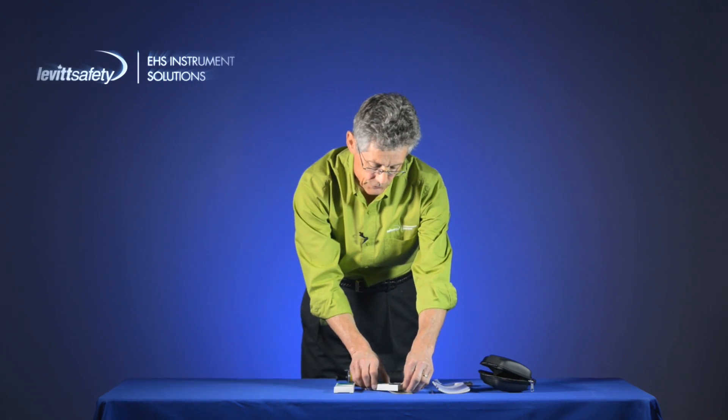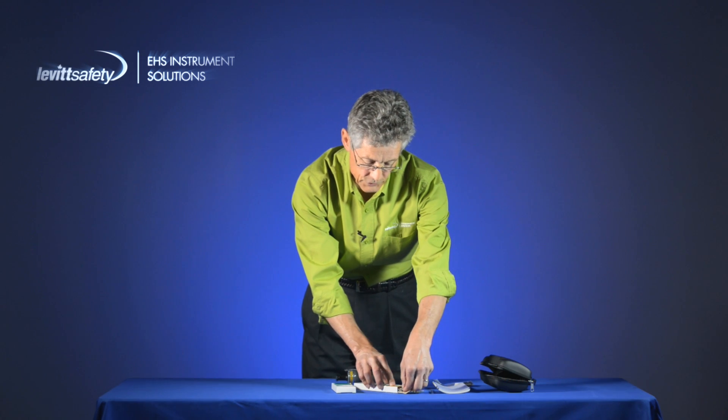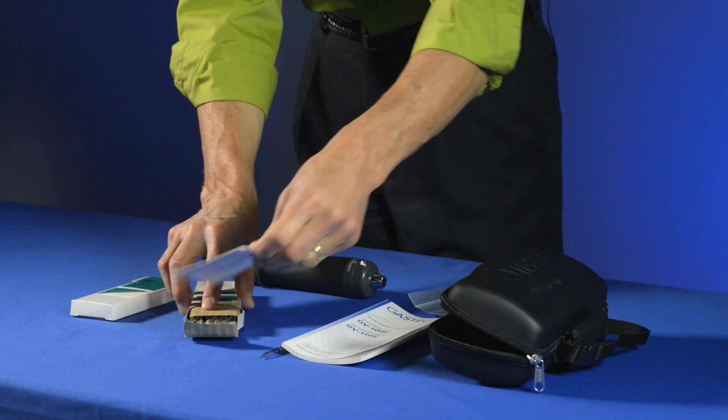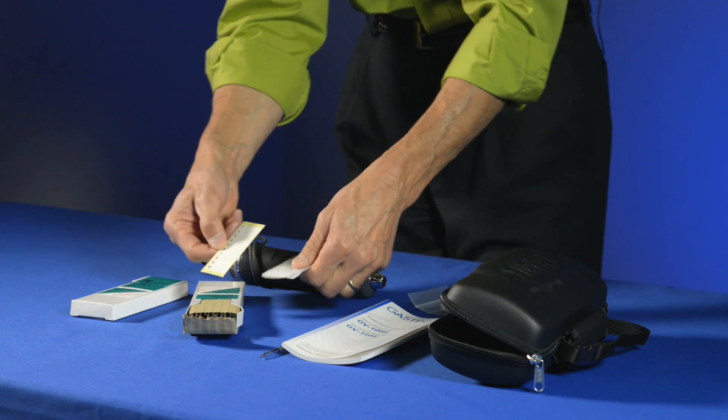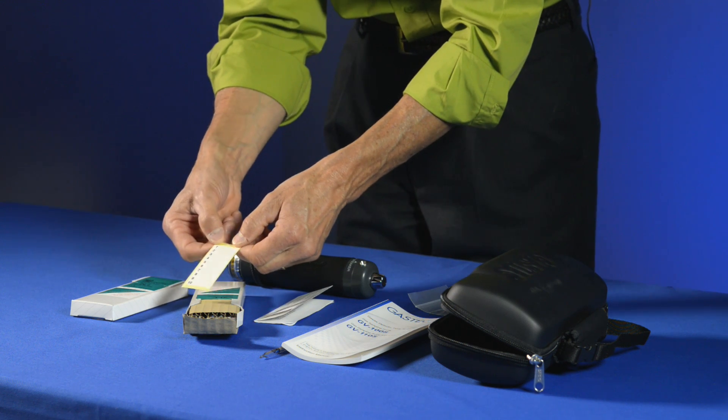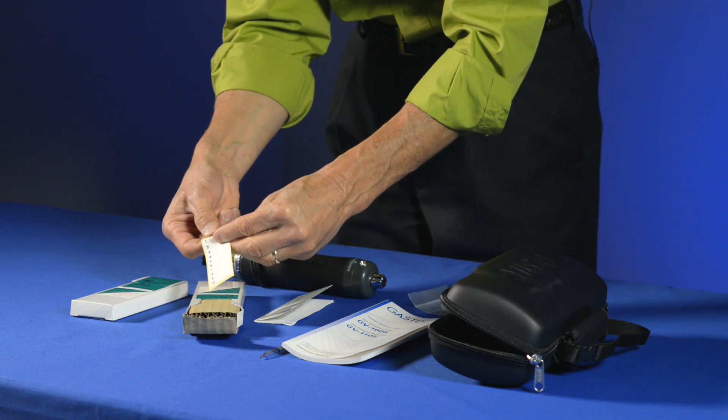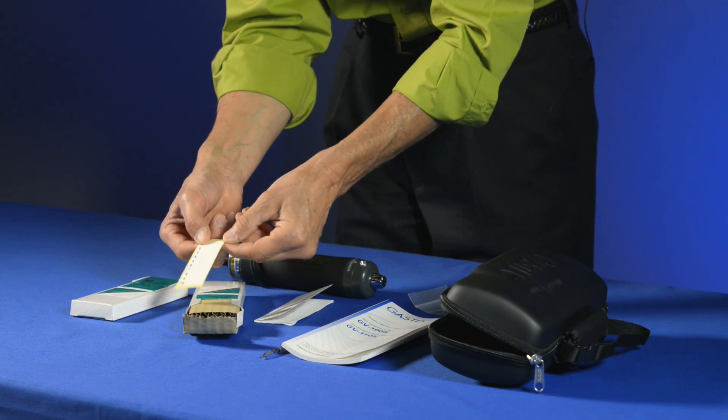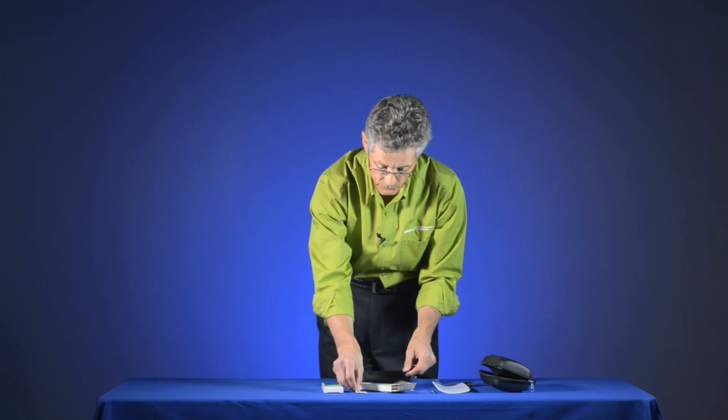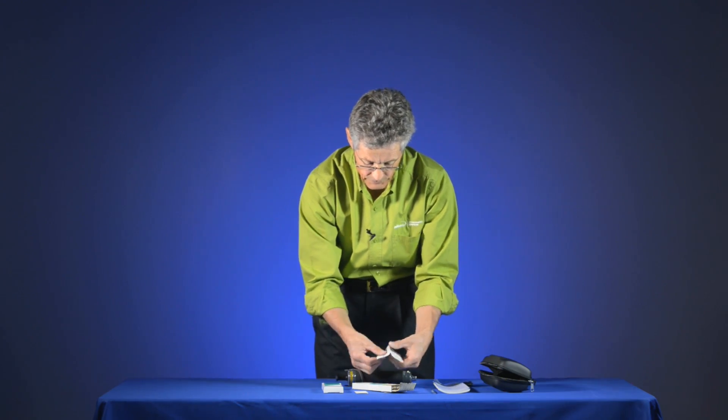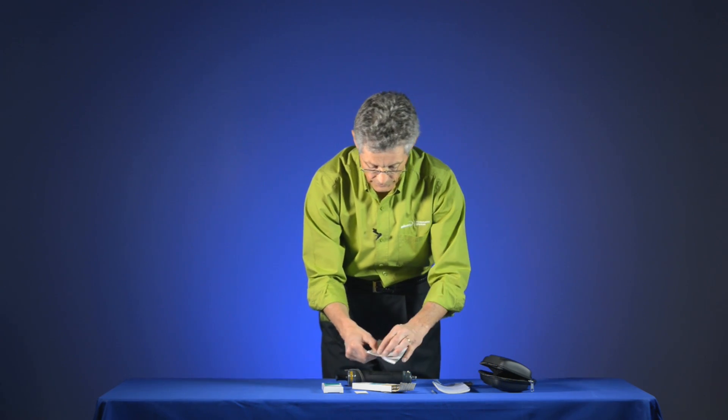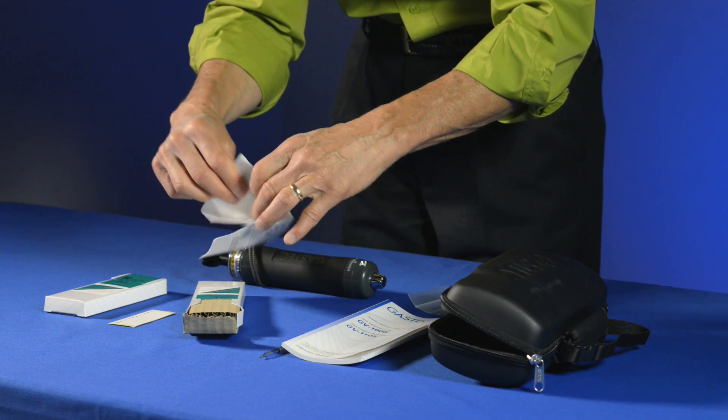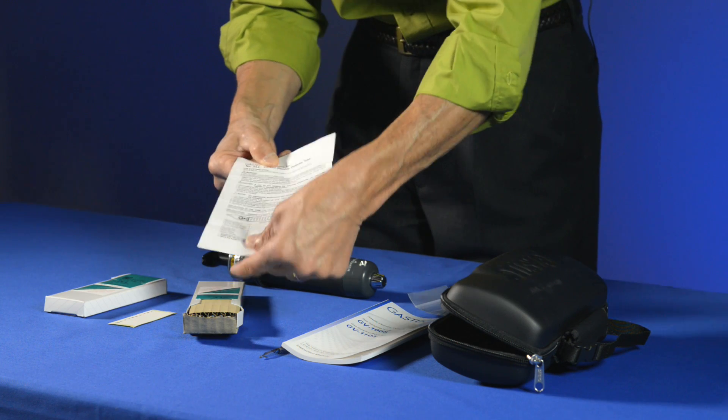So inside every box of tubes, besides the tubes, there are two other pieces of information. One is a little card where you can write some notes on and peel them off and put them on the tube once you've completed your sampling, because the tubes aren't a permanent record of the gas concentration. And then the other is the instruction for the actual detector tubes that you're going to be using.